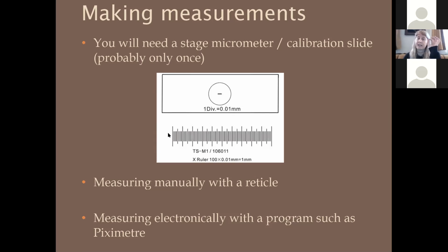So you'll see both this under your eye, and you will also see another ruler on top of it. So you're going to measure how many of these are present for each marking on your ruler in your eyepiece. Okay, and then write that down for each one of those. And again, the document that I'm going to link tells you more details about that.